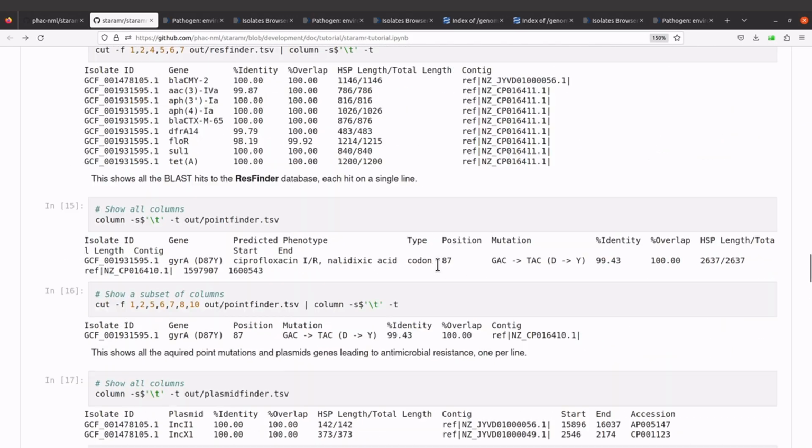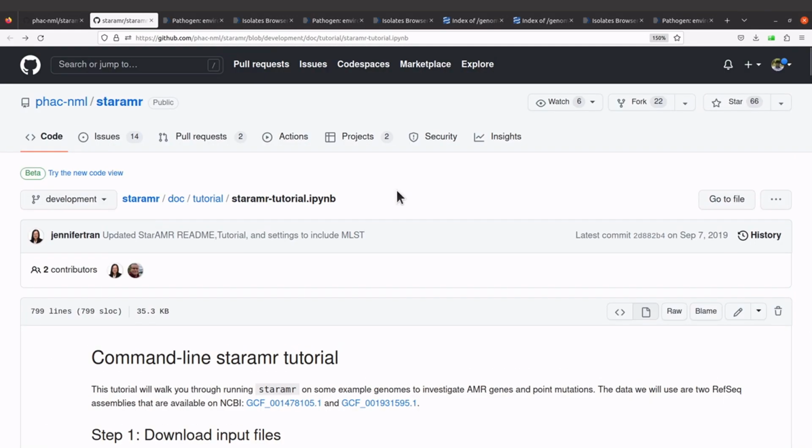So just check the page here. You have this tutorial to help you get started.